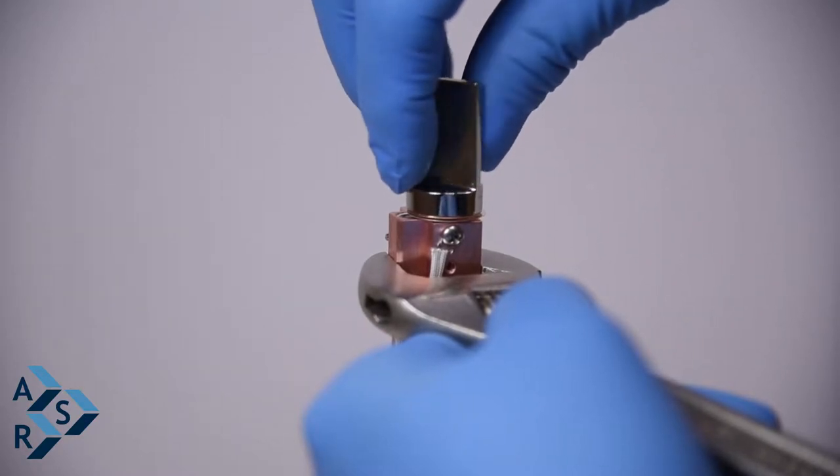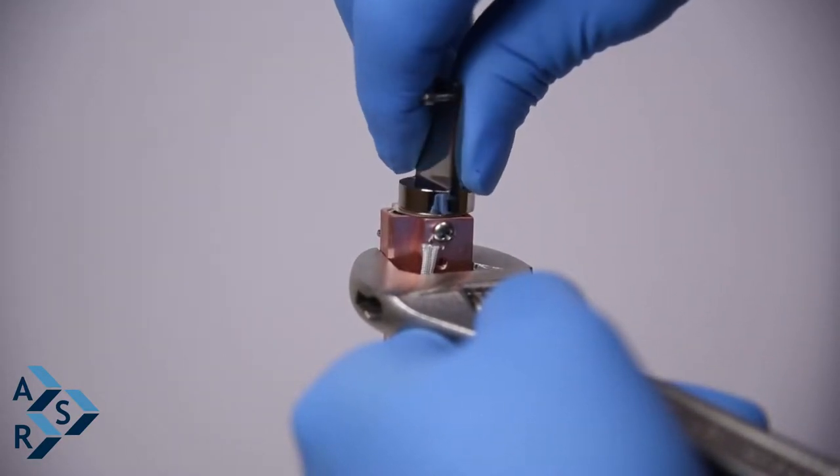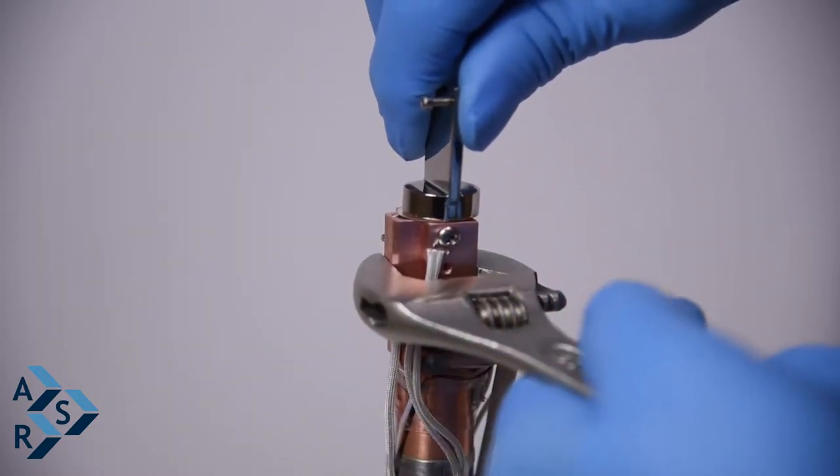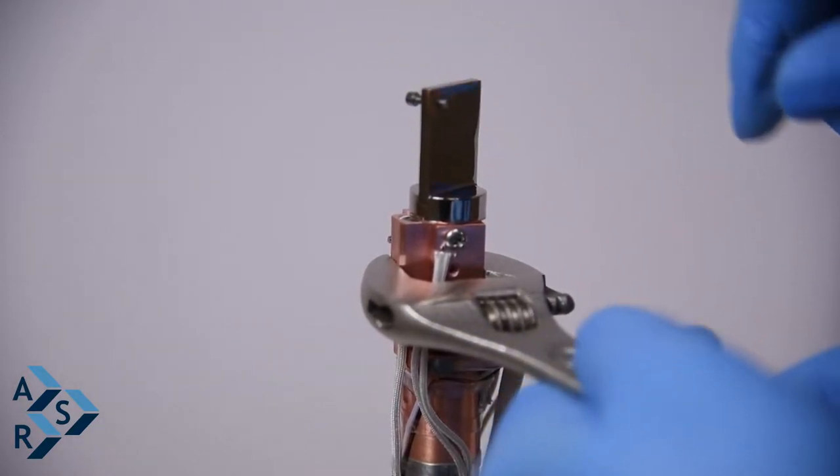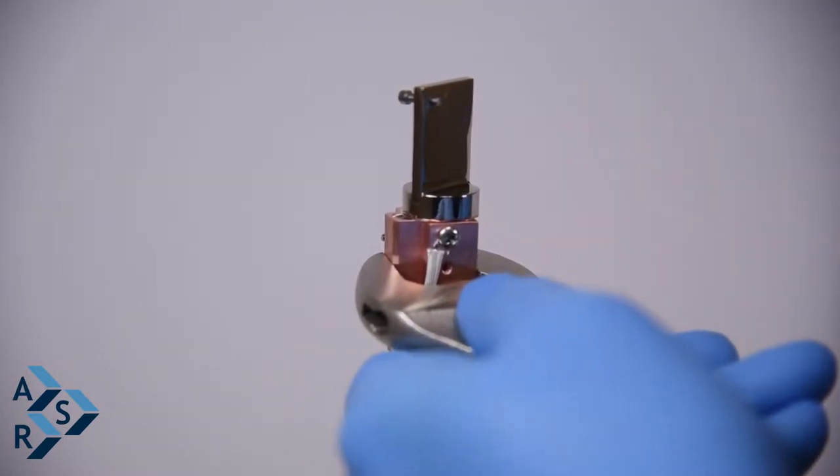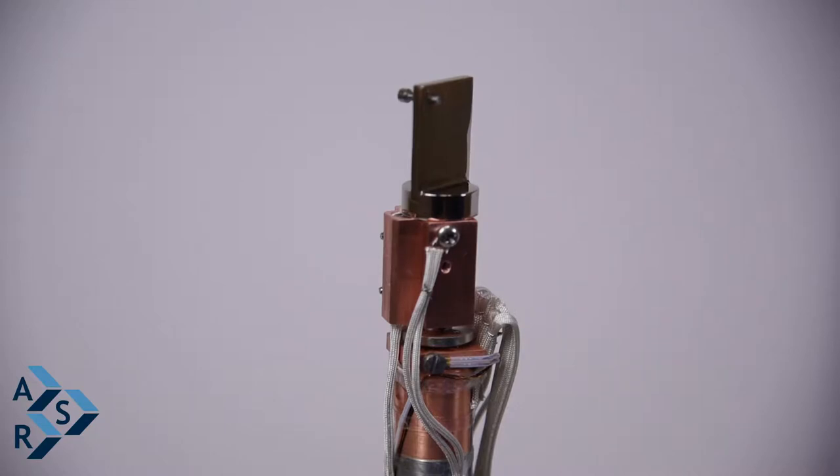And then when you tighten your sample holder, apply pressure. Tighten it tight so you make sure you get good contact between the interface and your sample holder, so you get a good temperature. And that's it.